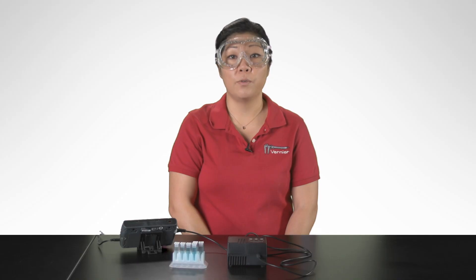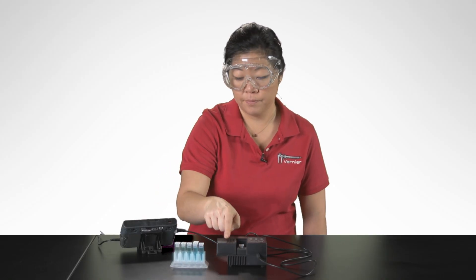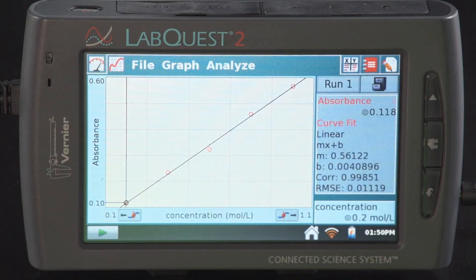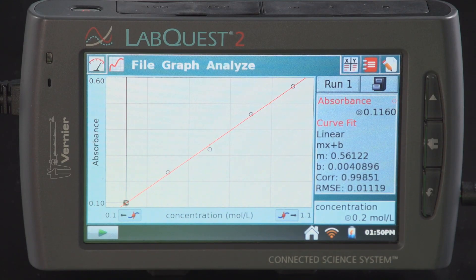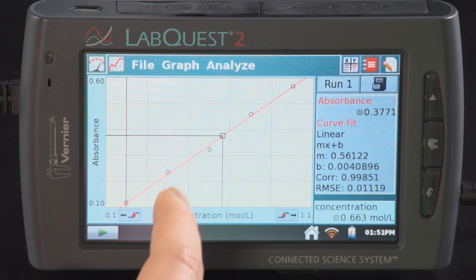To determine the absorbance of an unknown sample, follow these steps. Place your unknown sample into the colorimeter, tap on the meter tab, and record the absorbance value. This unknown sample is showing an absorbance of 0.302. Tap on the graph tab, then tap on analyze and select interpolate. Tap along the graph to get close to your absorbance value. The absorbance reading is shown in the upper right corner — my sample had an absorbance of 0.302.